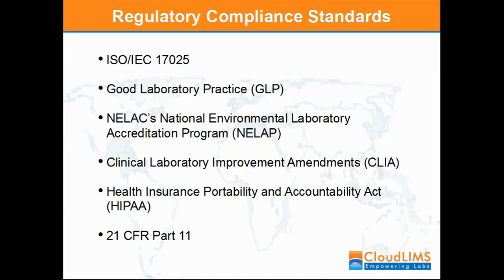The other compliance requirements for testing labs include the GLP, the Good Laboratory Practice. The primary objective of GLP principles is to promote generation of high quality test data that is validated. When data is submitted by a GLP compliant lab, it assures regulatory authorities that it corresponds to actual results obtained during a test, deeming it as reliable. GLP principles are not intended to define scientific standards; rather, they define the quality standards for conducting a test or study, data collection, and reporting of results.